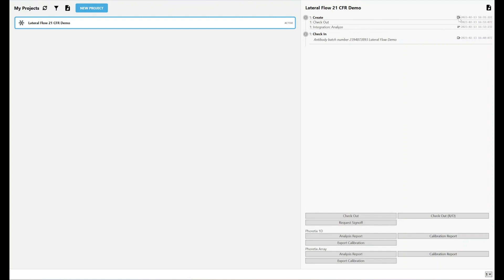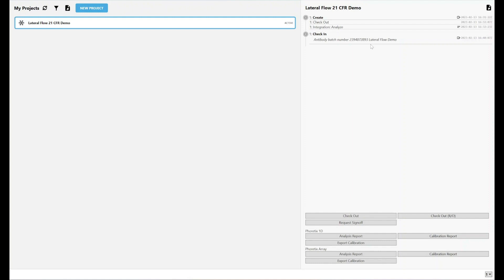I can actually go back to previous revisions if I want to. If I click this button here, I can check out a read-only copy of revision 1. If I had made some changes to the data and I wanted to see what had changed between revision 1 and 2, or what had changed between revision 2 and 5, I can check out a read-only copy of the previous revisions to see how things have changed and potentially go back to them if a change has occurred and been checked in that is undesired.